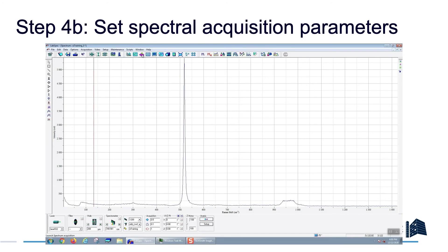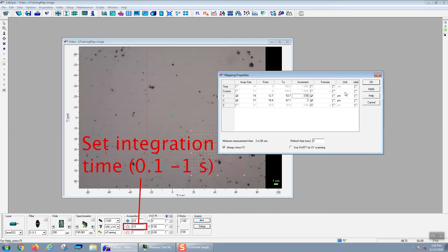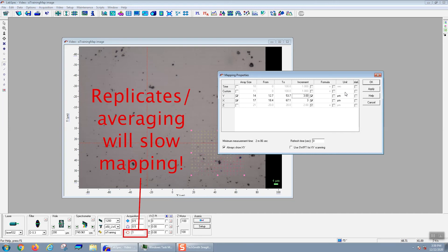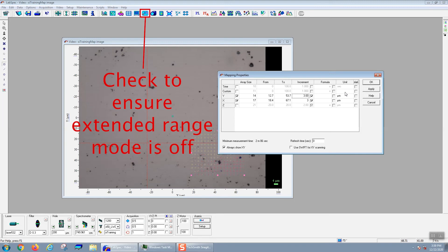Next we'll set the spectral acquisition parameters, namely the integration time. You want to set this to be fairly short because otherwise you'll be multiplying that integration time by the number of pixels, which could end up being a very long time. You also don't really want to average very many spectra for the same reasons, and you generally don't want to use extended range mode. You can, of course, do all of these things to get very high quality or broad spectra. But typically when you're mapping, you're trying to focus in on very specific points or wave numbers in your spectrum.